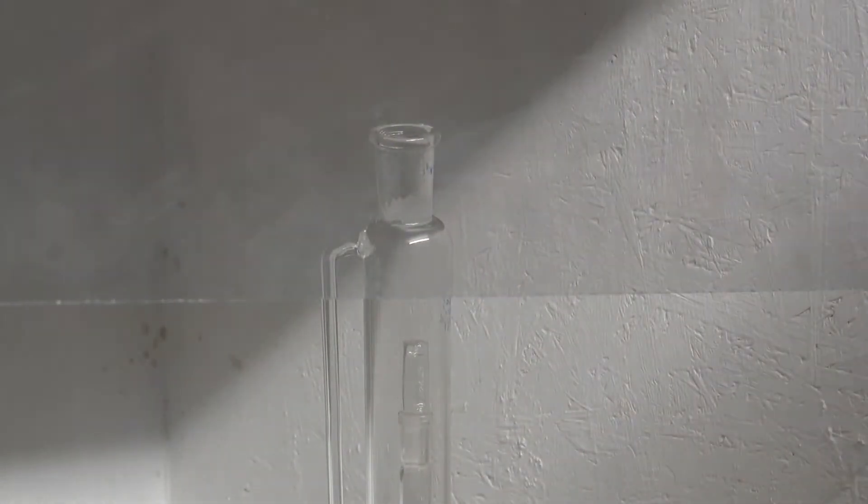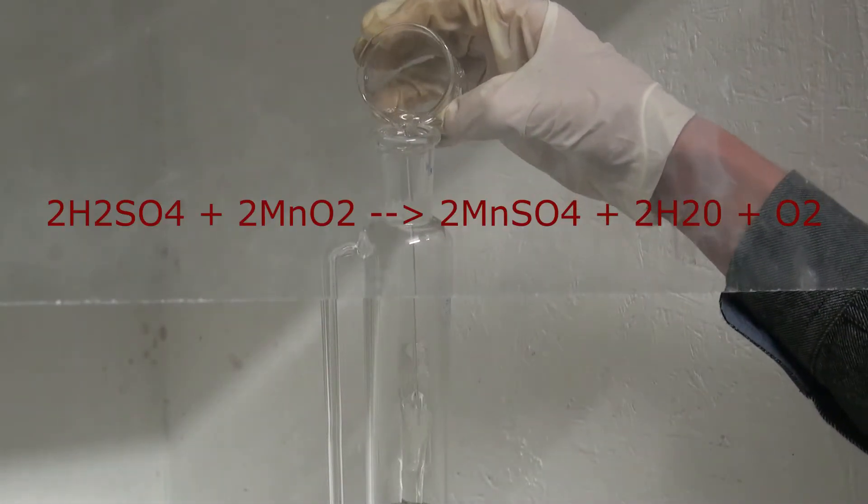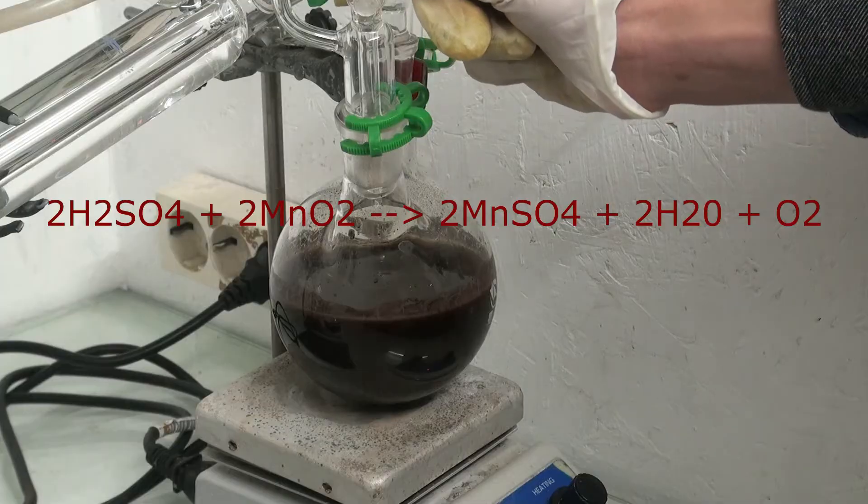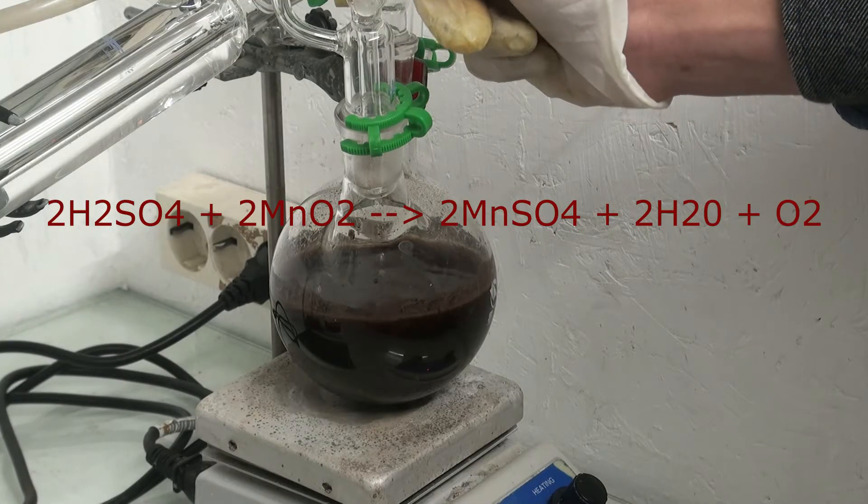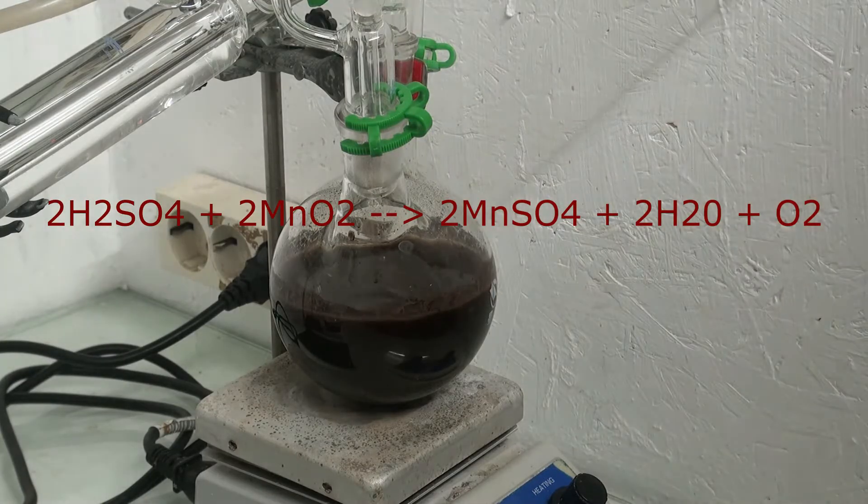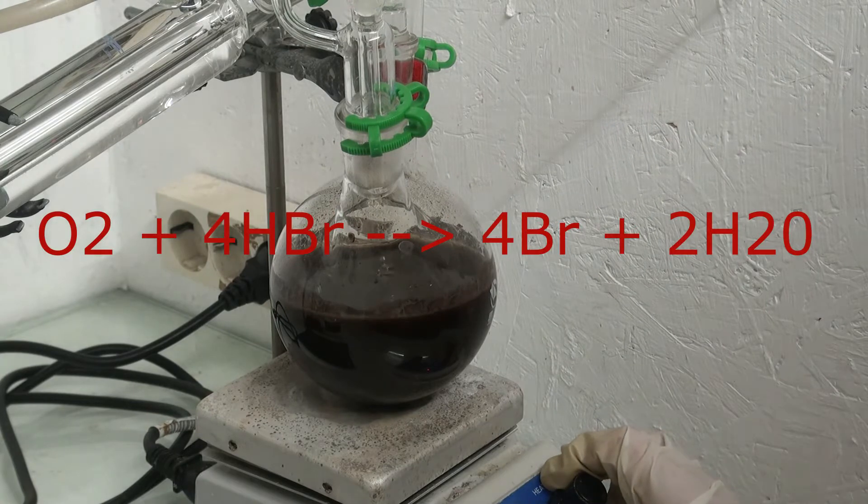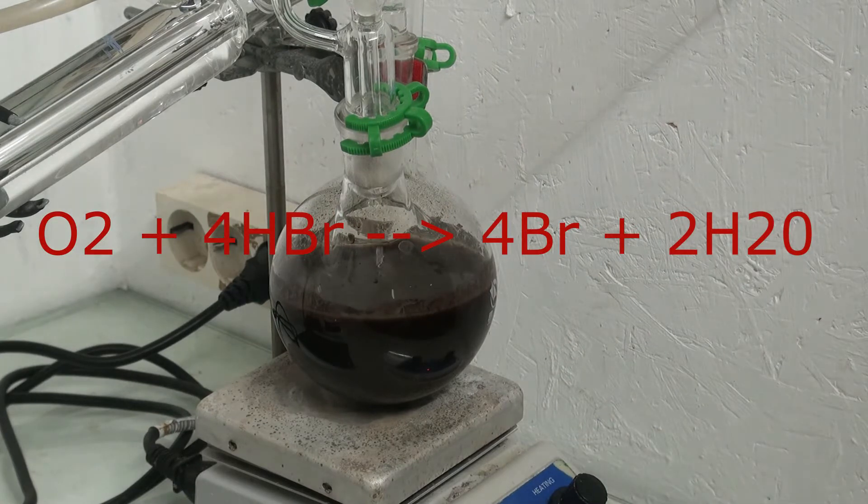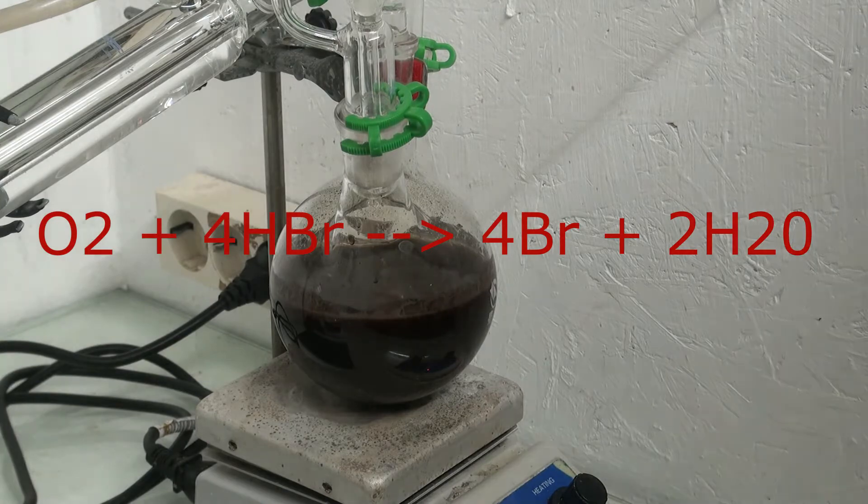From a pressure equalizing funnel, I slowly added in sulfuric acid. The sulfuric acid makes the manganese dioxide give off oxygen. The hydrobromic acid then reacts with the oxygen to form bromine.